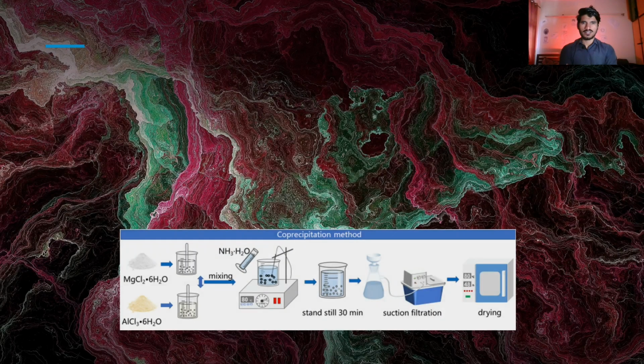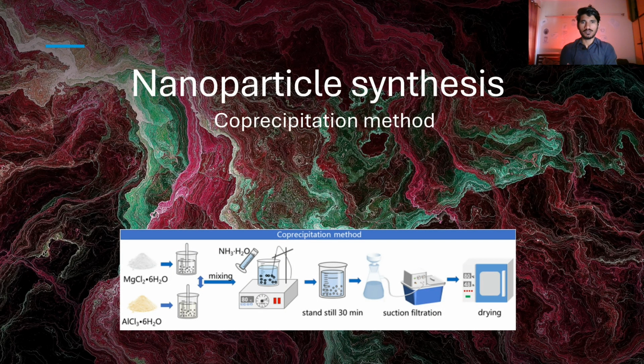So welcome back to the series of videos on nanoparticle synthesis, in which today I am going to describe how you can prepare nanoparticles through the co-precipitation method.